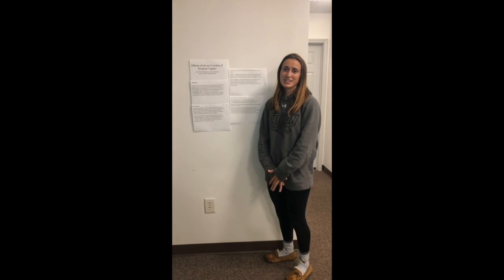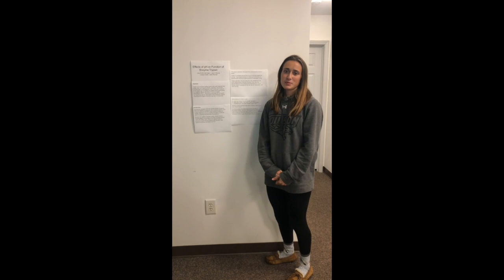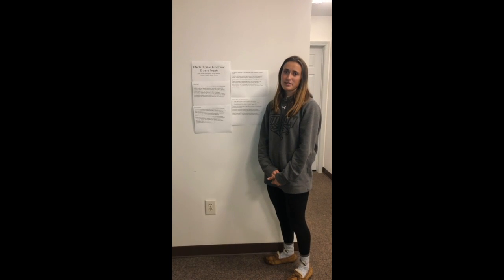Hi, my name is Civetti, and my group tested the effect of pH on trypsin function. This experiment studied trypsin, which is an enzyme found in the intestines.